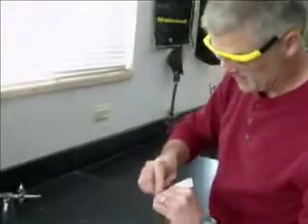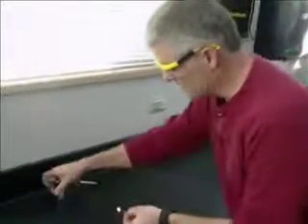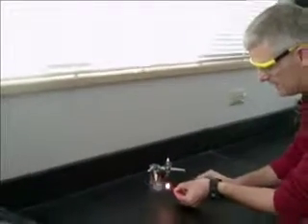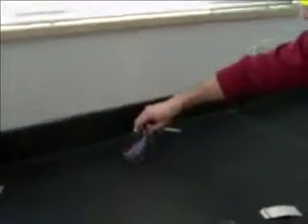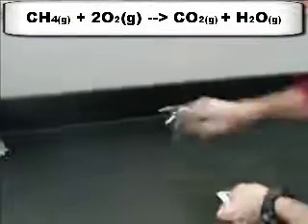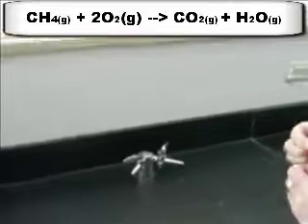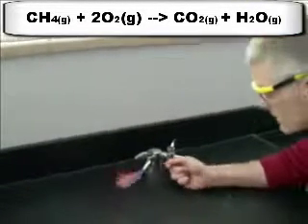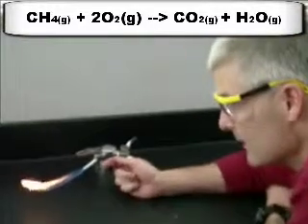So I'm going to light a match. I don't have a lighter, but I could use a lighter too. It doesn't matter. And guess what? I can essentially make a flamethrower. Oh, it went out because it's just too much gas. Now, an interesting thing about this is right here, we're producing the gas.